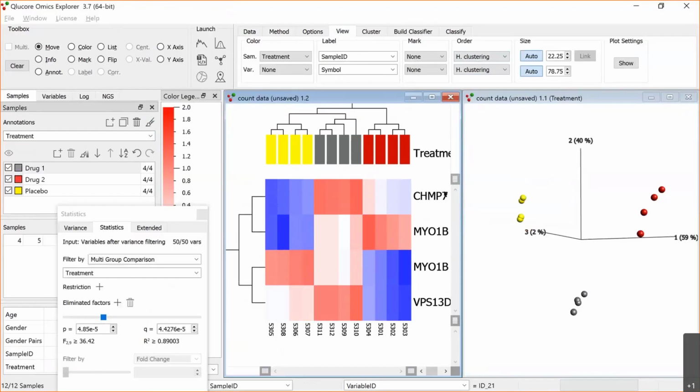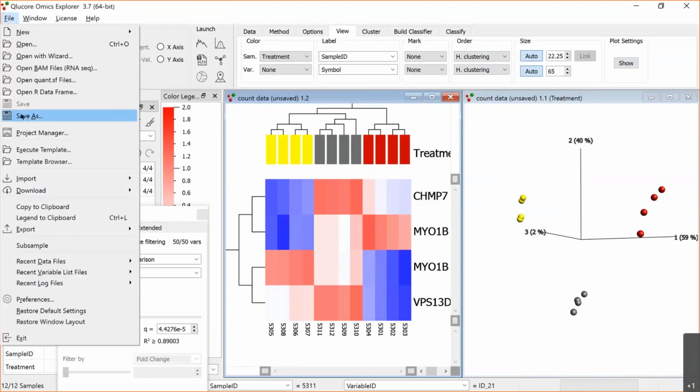Like that. So here we have the results. So we see that we have a couple of genes here that are differently expressed between the different groups. So this is very straightforward. So in this case, you actually had everything, all the annotations in here. And again, you want to save this as a G-data set, because then next time you don't need to perform the normalization.